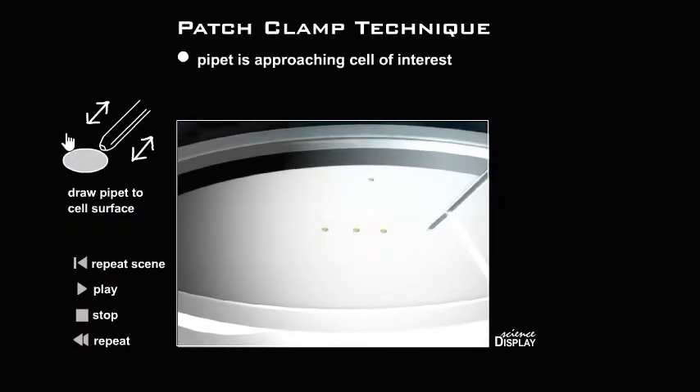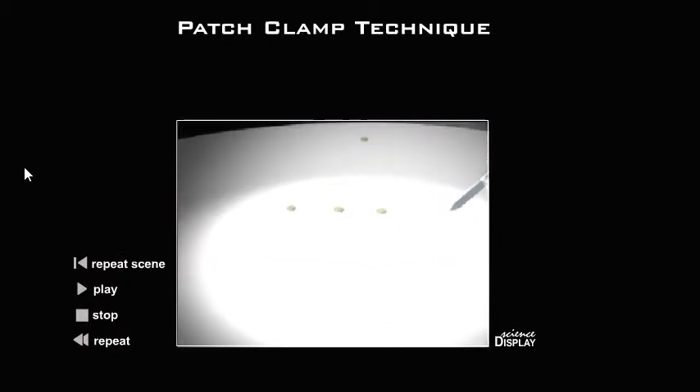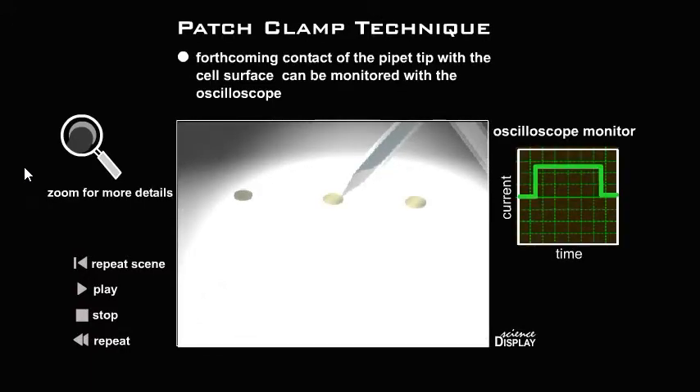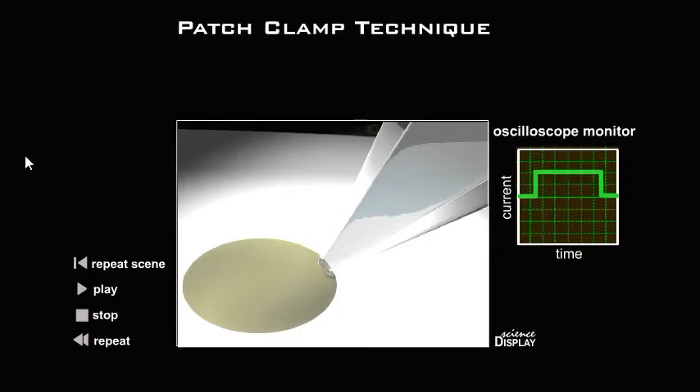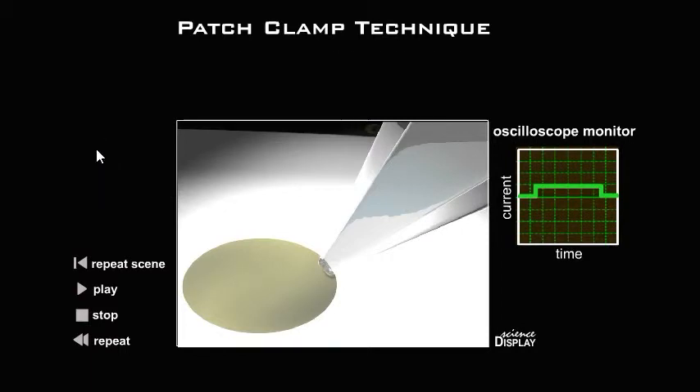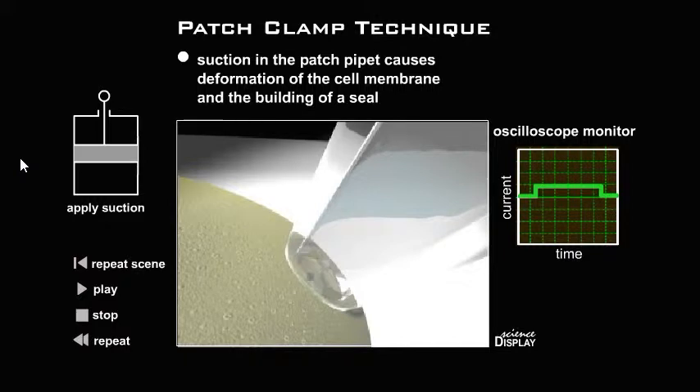The pipette is approaching the cell of interest. Draw the pipette to the cell surface. To get a seal — the tight contact of the pipette with the plasma membrane — a soft suction has to be applied.